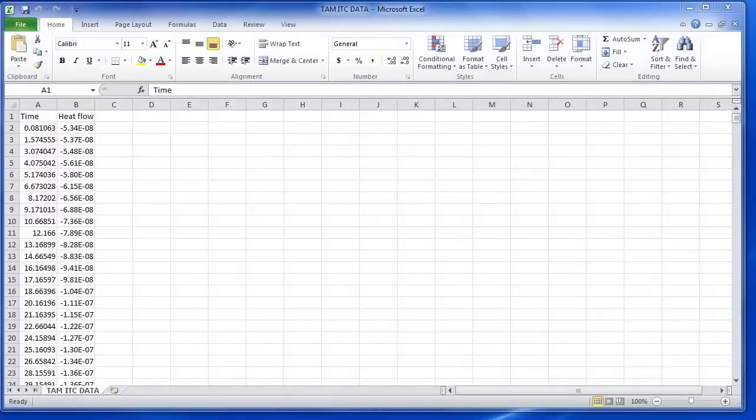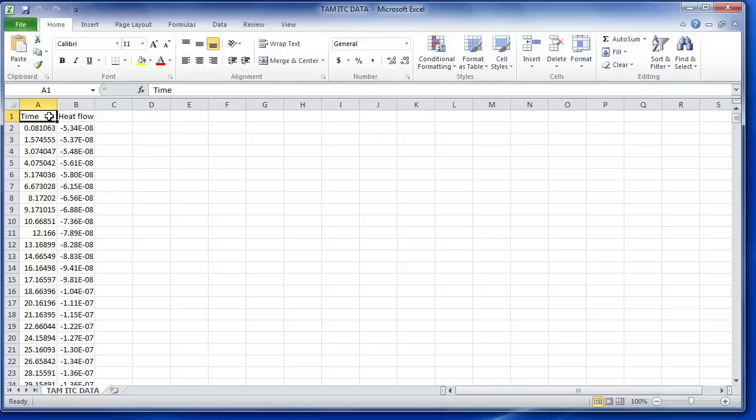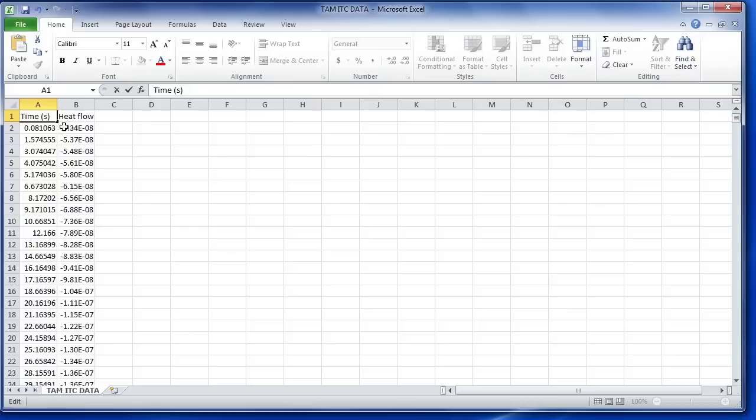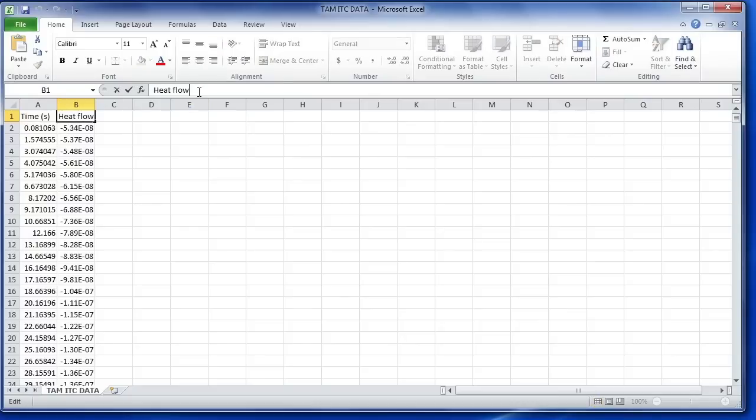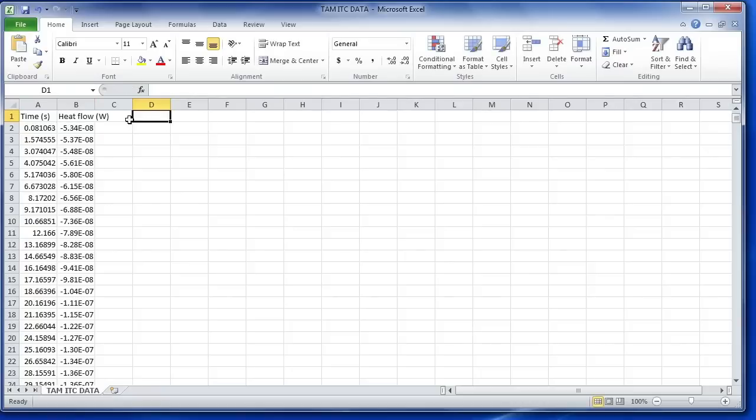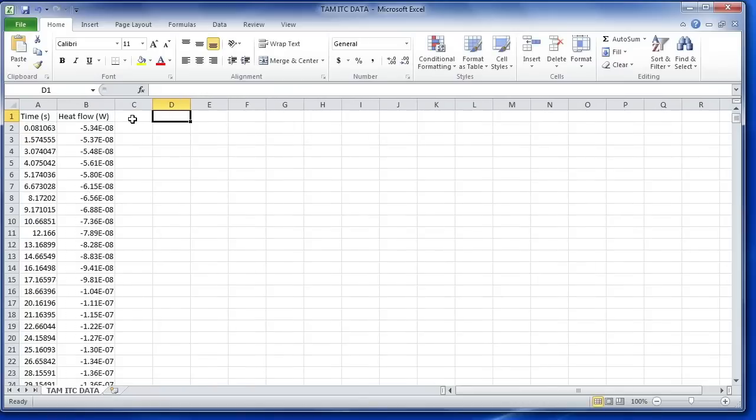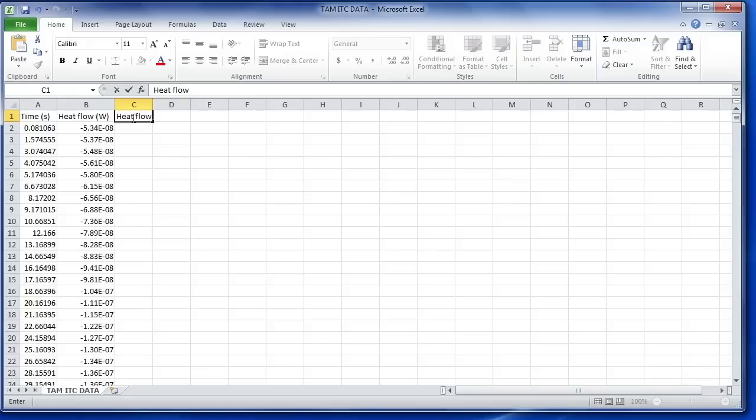After the TAM data has been exported, it can be opened within Excel and inspected. It's important to note the units that were exported within the data. It was time in seconds and then heat flow in watts. The supported heat flow value is a microjoule per second in NanoAnalyze, or a microwatt. So these heat flow values will need to be converted to the correct units.